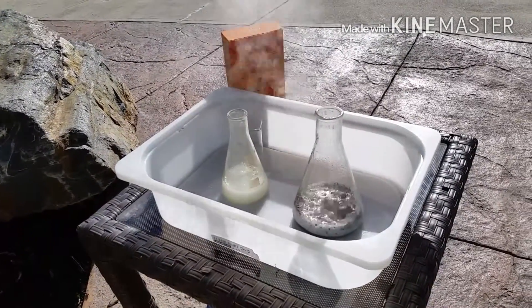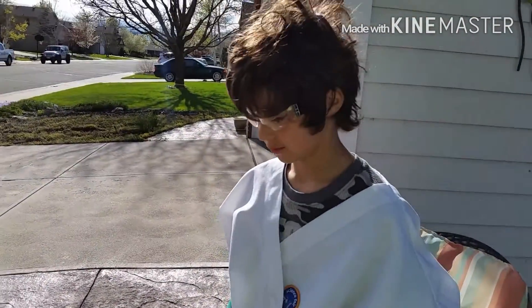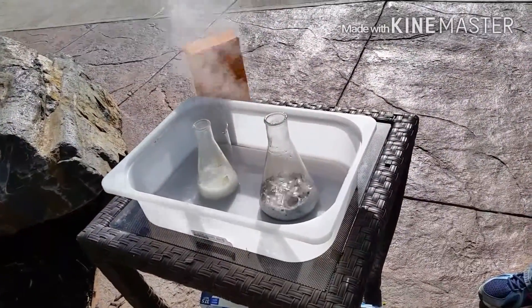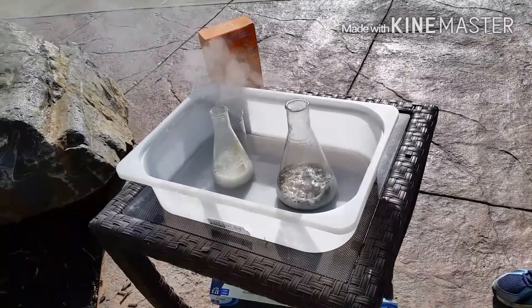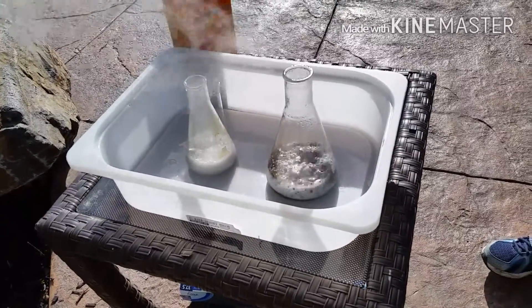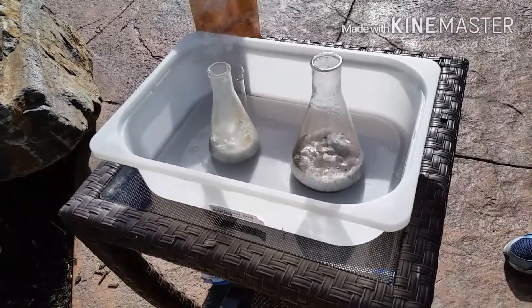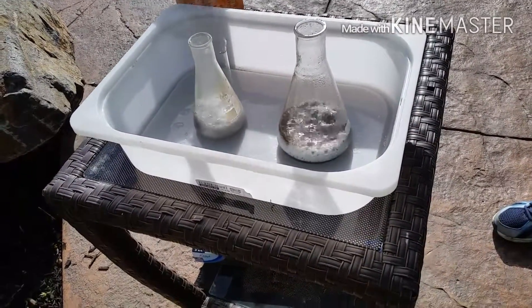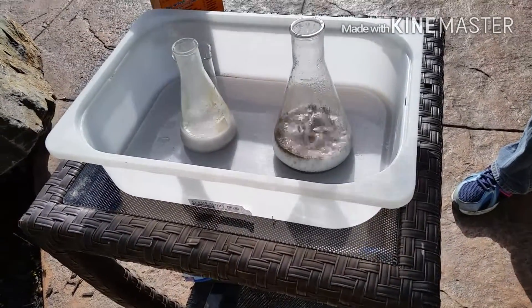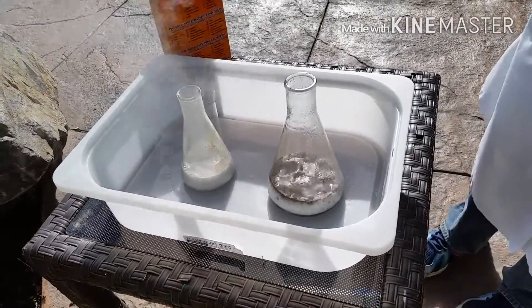The water is boiling around it, I think, because it's so hot. The other one's now turning a cloudy white. The other one's turning dark. Now the smaller one looks like it's getting a little gray — yeah, the smaller one's getting gray, or maybe it's just the shadow.